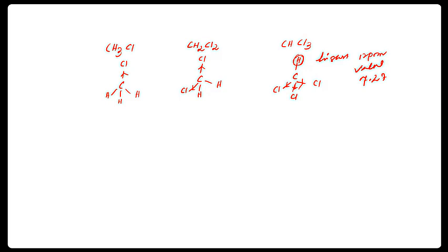When you do your research, you have to do the NMR recording with CDCl3 as solvent. At that time, you will find this value, and every day you are going to become familiar with this value 7.27. Among these three, this will have the lowest ppm value. It is 3.06 ppm, and this is the medium one, 5.30 ppm. This is due to the fact that this proton is the highest electron deficient.